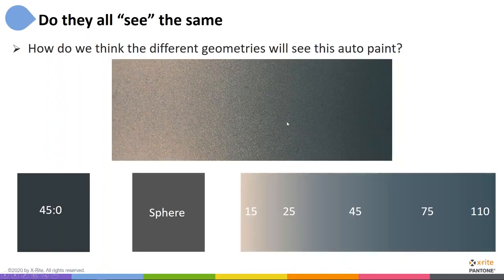And then if I measure that with a multi-angle 5-angle instrument, I'm going to get that. Those are the colors it sees at those different angles. It's going to start to represent more closely what we see. So again, what product is it that you're measuring? What are its properties? That might tell you which instrument is going to agree better with what you see.